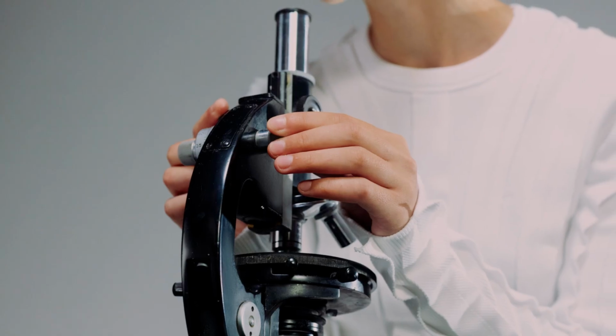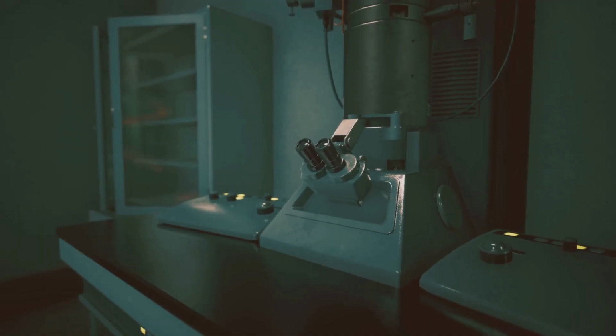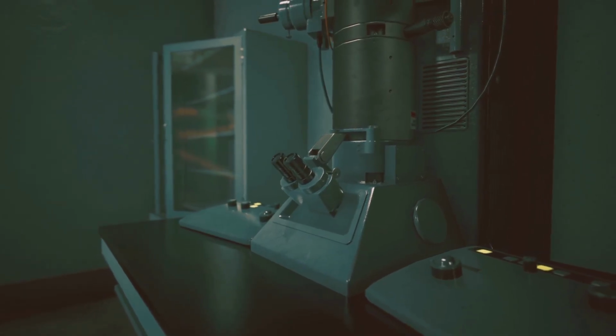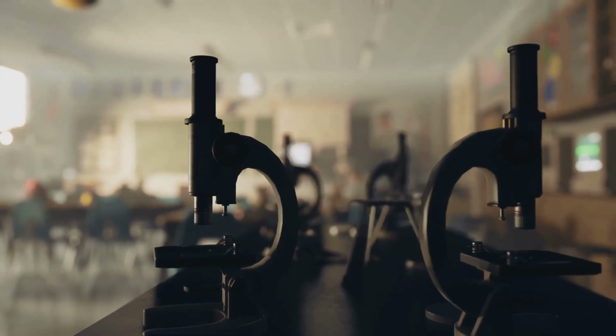Now, what if you need to see things that are smaller than 200 nanometers? What if you want to see the intricate details of a virus or the fine structures inside a cell's powerhouse, the mitochondrion? For that, you need a different kind of tool, an electron microscope.